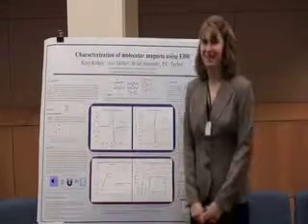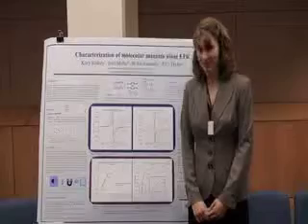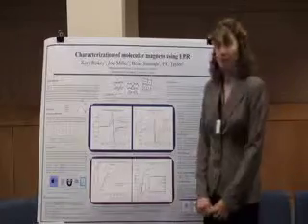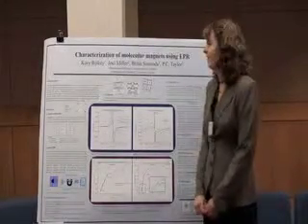My name is Korey Riskey. I go to Colorado School of Mines. I will be a senior this year. I was working this summer on the characterization of molecular magnets using EPR. These are organic molecular magnets.